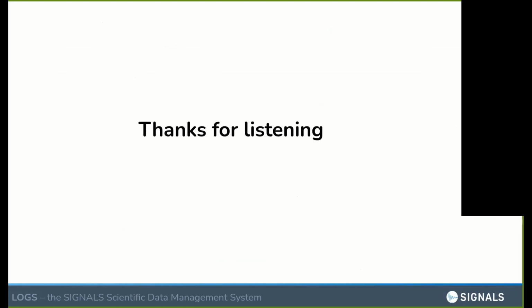And with that, I hope I could show you that using Python or scripting in combination with logs gives you much more power in automation and analysis, and you can basically make your life in the lab, your daily life, much easier using this kind of things.